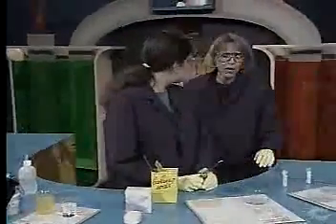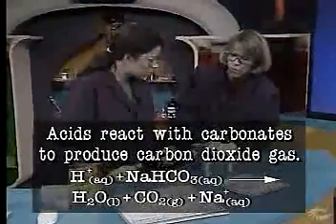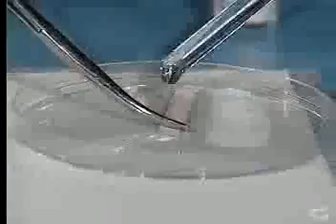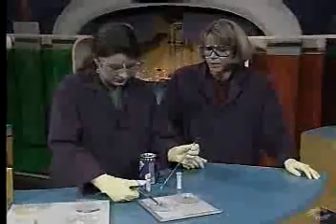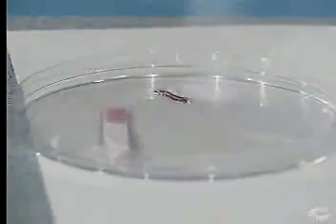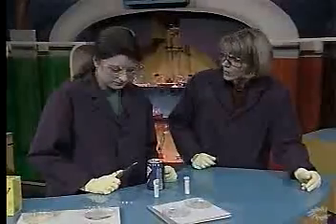So now, these diagnostic tests, we can use them on your beverage. Here it is. Which one will you use? The litmus paper would probably be the easiest test. Okay. So take a sample of your beverage, put it on the litmus paper. Okay, I'll put it onto the red litmus first. And it stays pink. Okay. I'll put it onto the blue. If I shake the extra off, it turned to pink. Good, so we can see it's changed color. So what does that confirm? That this must have acid in it. That's right, according to the litmus test.